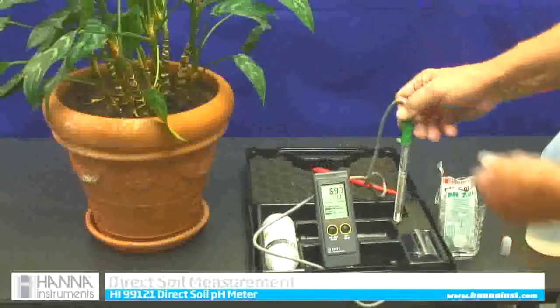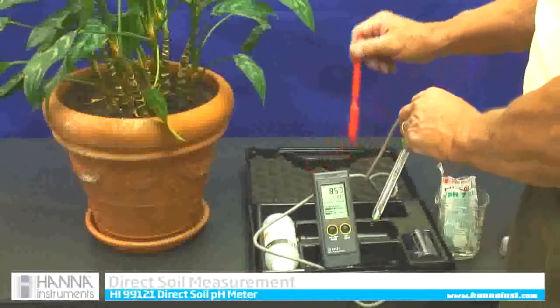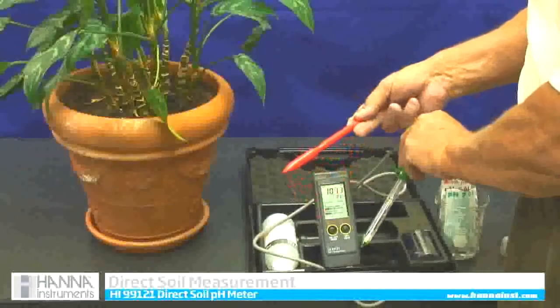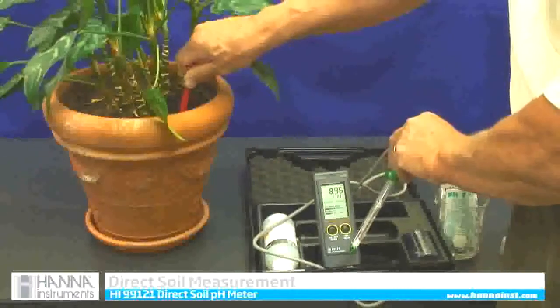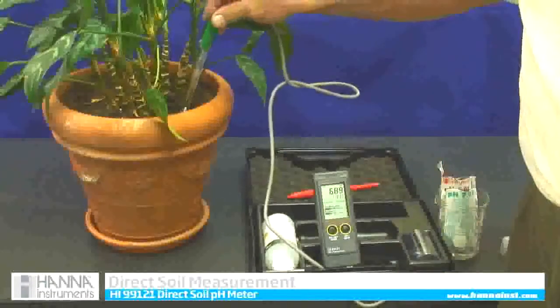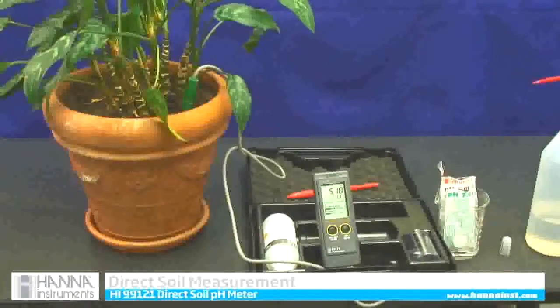Now to take a soil sample or to measure pH in the soil, we have this lovely house plant that has been in the office. Because my probe is fragile, I am going to take our little doubler stick that comes in the kit, make a pre-drilled hole, and then insert my meter into that hole. Whatever the green tip is touching will give a reading. My reading is 5.18, so close to 5.2 pH.